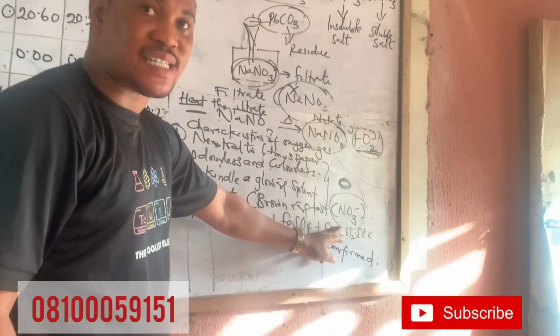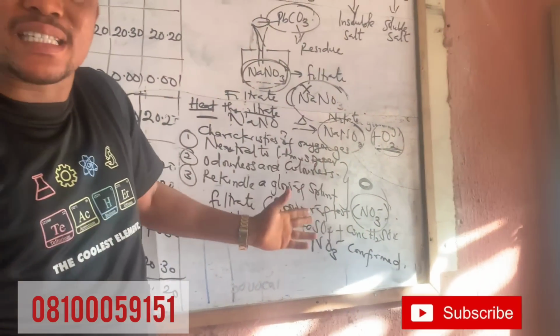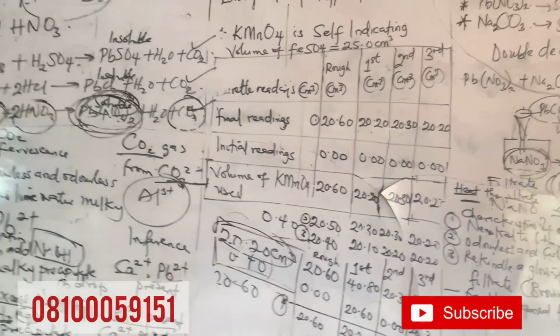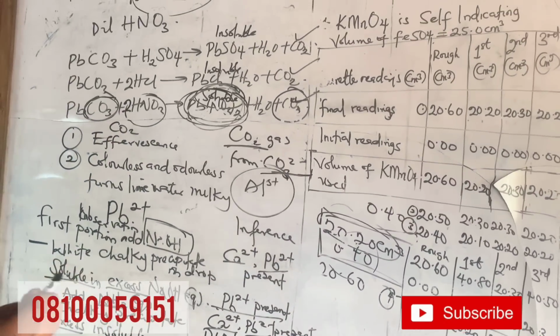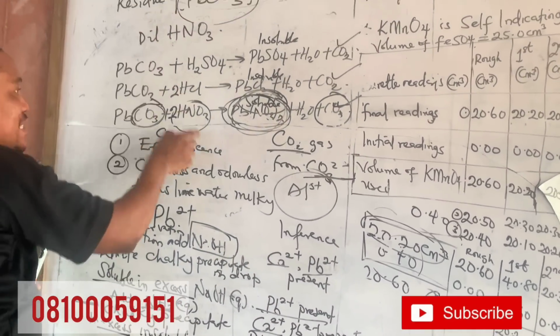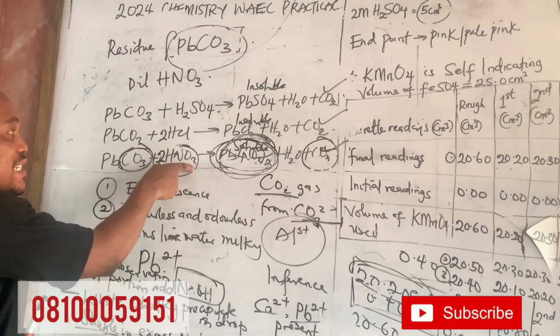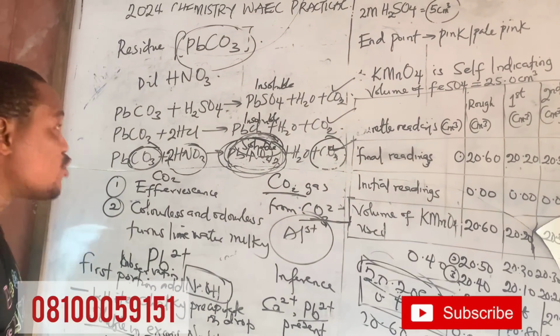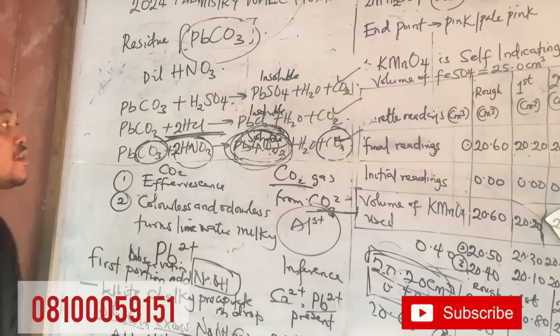You see that we have tested for nitrate ion and we have tested for sodium. That's the flame test. But I'm not expecting that, but that is it. But if we are asked, which is the last one now, if they now ask you to add, for the residue now, we started from them telling us to add this, we get this, then into 3. I told you 2 or 3. So in the third one, they might not ask you to add this.